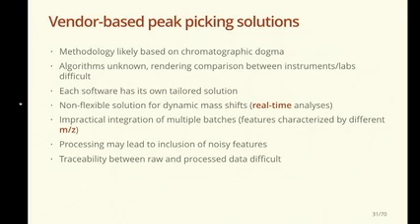I mean, you really have to look at your raw spectral data. I've spent many hours just looking through the text files with the numbers to trace back what is really happening. So it can be quite challenging at times.